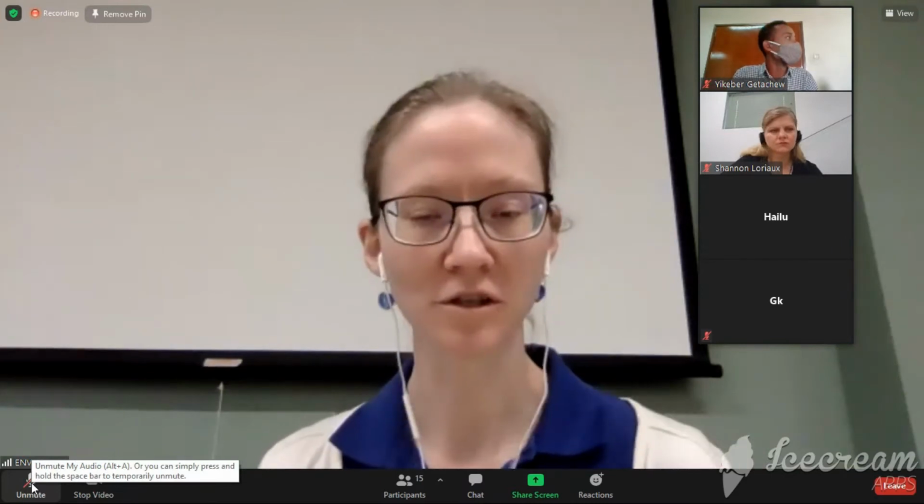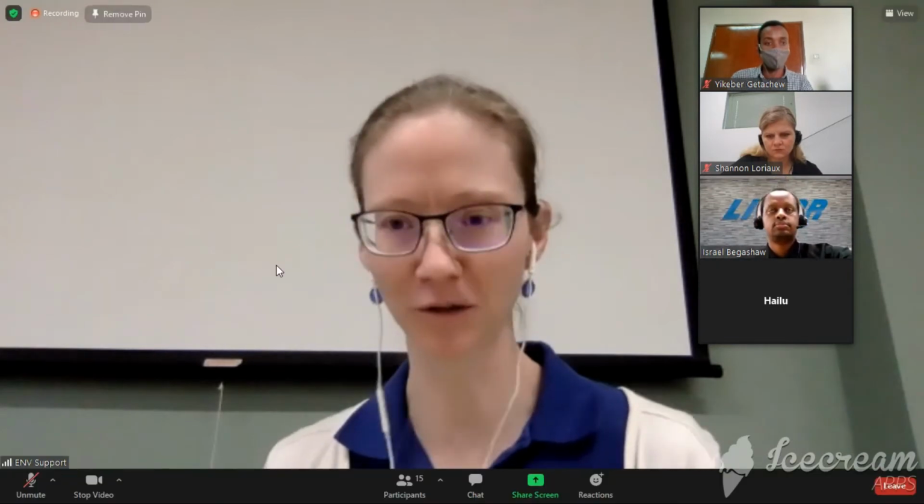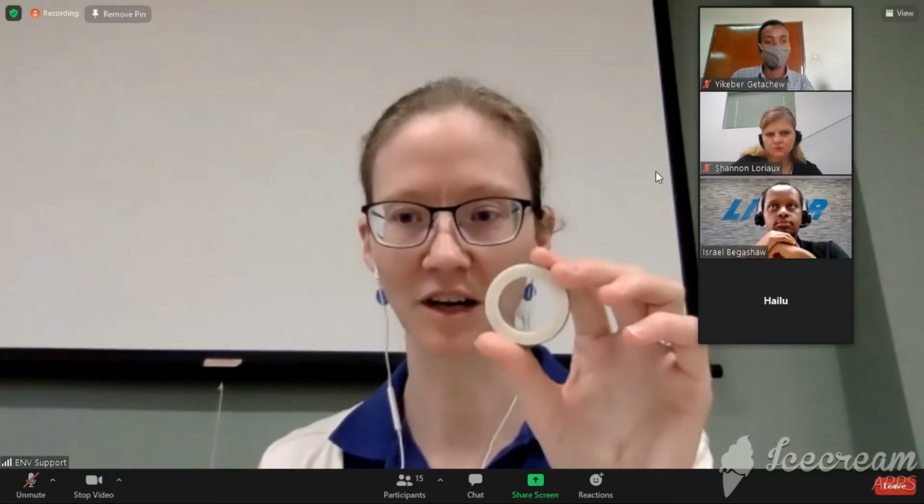The other thing I want to do, since we were talking about apertures, and sometimes it's hard to tell, I showed the picture, or Shannon shows the aperture, and you think, well, what's the difference? So this is the 6 square centimeter aperture. And this is the 2 square centimeter aperture.